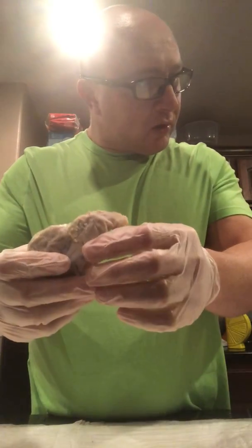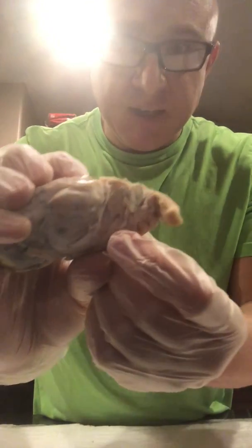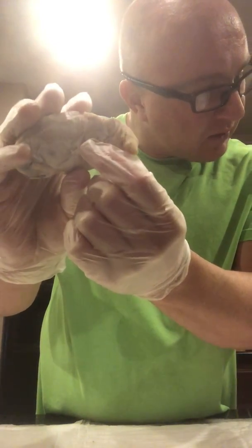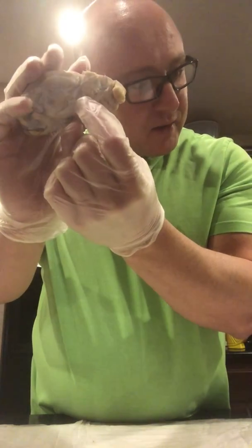The superior colliculus, that's going to be roughly here, and it's going to be right behind the cerebral peduncle. And then the inferior colliculus is below the superior colliculus. So it's going to be here.